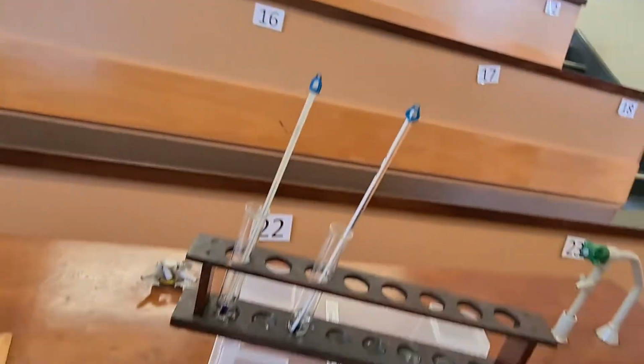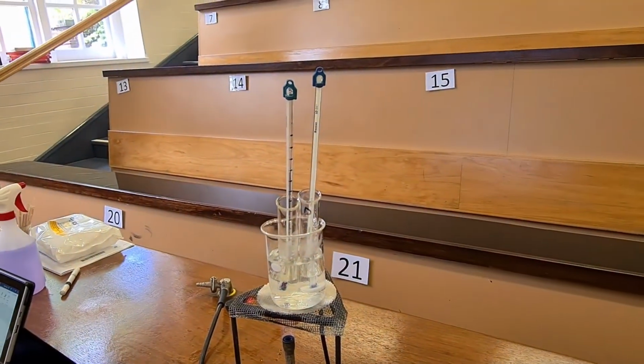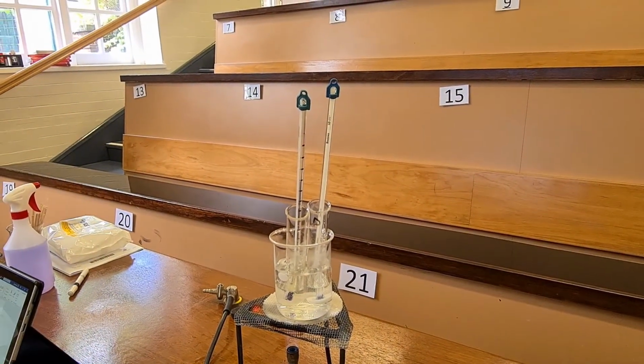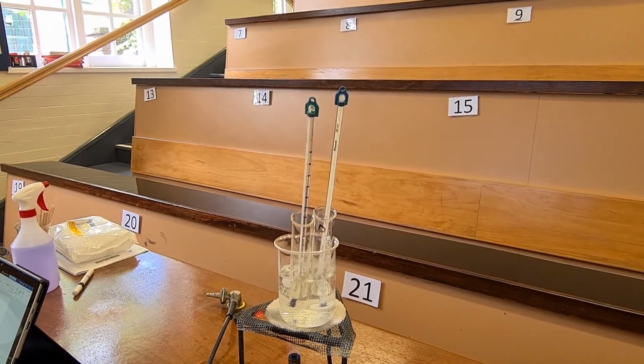But those first two, A and B, they are cooling down. Now, I'm just going to grab a holder.